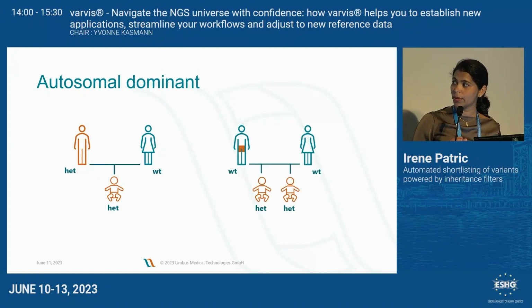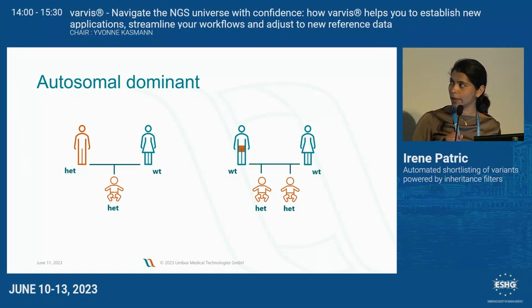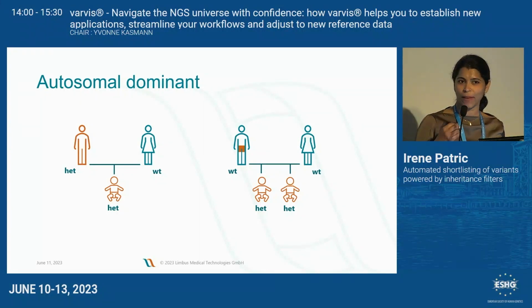But when you have an additional affected family member, you would like to see this in the tool on one click. Of course, there are certain tools that cover this as de novo, but is it really de novo, and how much effort you have to put into cross-verifying this information. I will also later in an example show how when it comes together in one click, it makes it much easier.